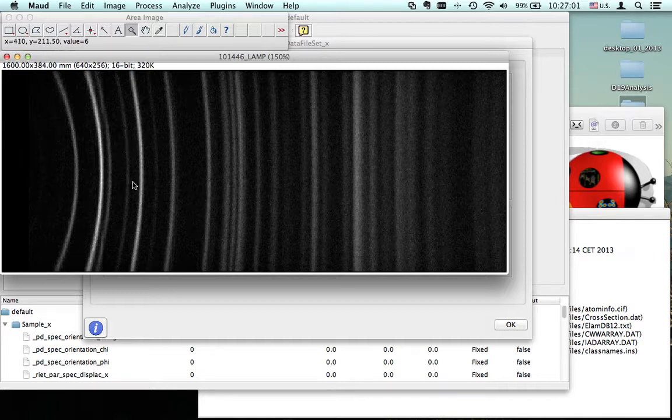So D19 also has a problem with a line here that is not working, one line of pixels. And in mode, I actually corrected it, so I interpolate between the previous and the following line. So you still get a usable image here, but there are also some other artifacts over here. Luckily, it's only a small part of the image, so it will not really interfere too much with our analysis. But we will not get a very good fit over here.